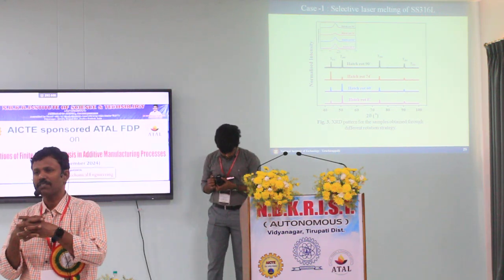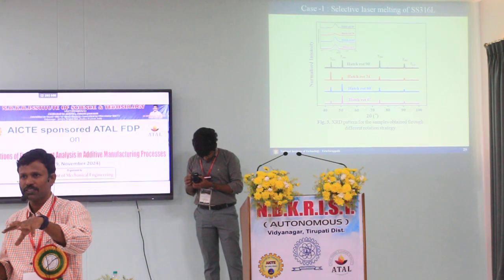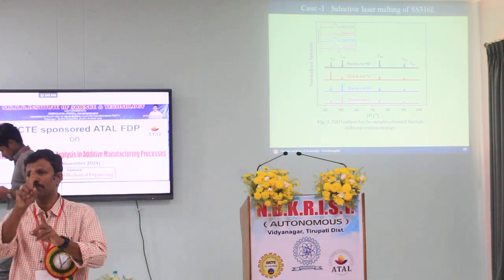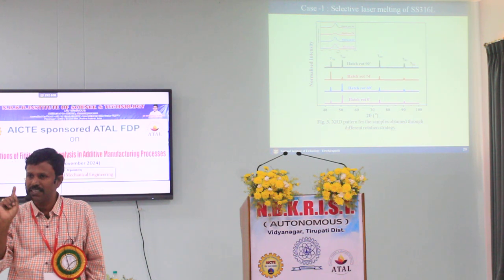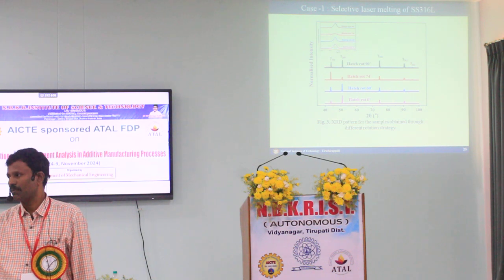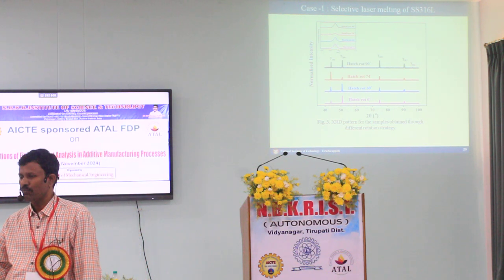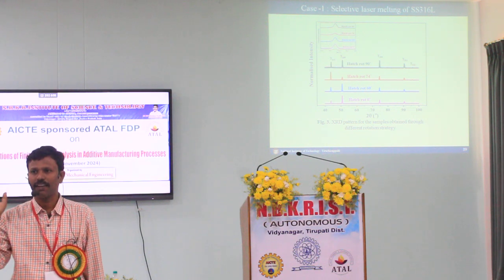So with this information, if I am doing it on the same material, the aluminum silicon carbide reinforced system, I will identify aluminum peaks. That means aluminum may have some silicon inside the matrix, whatever it may be, we will get aluminum-related peaks, plus separate silicon carbide peaks. By seeing those peaks, I can confirm that the particles inside are silicon carbide particles. Maybe titanium diboride or zirconium carbide, whatever I am keeping as reinforcement, you can identify exactly. That is called phase analysis.